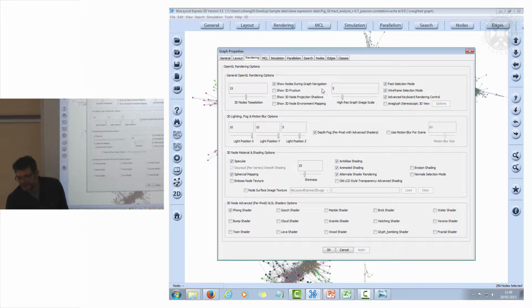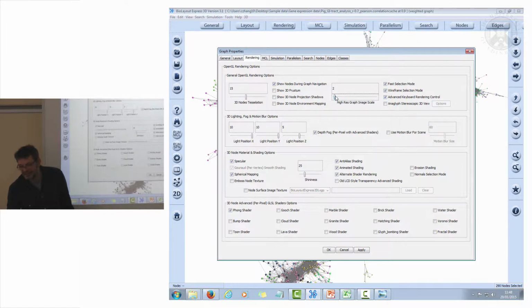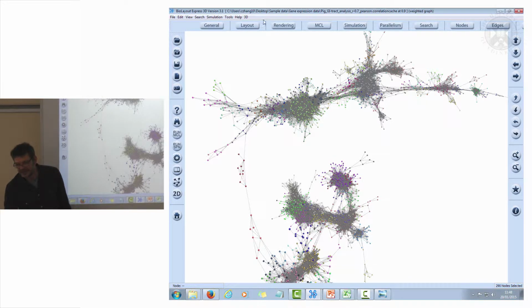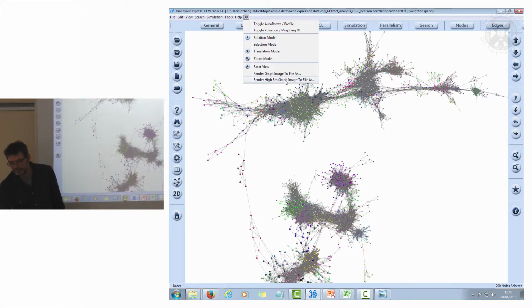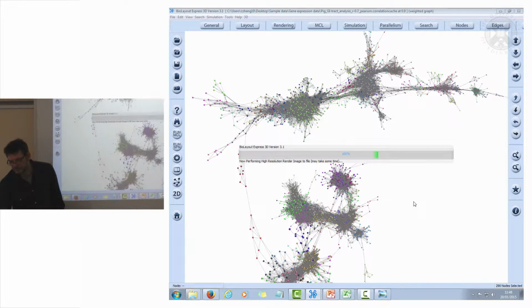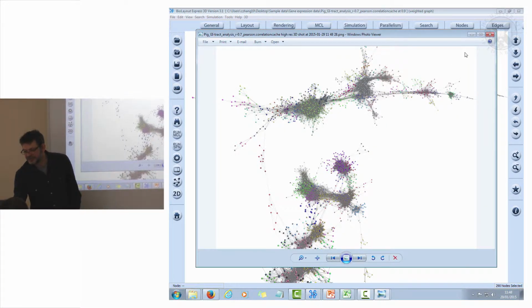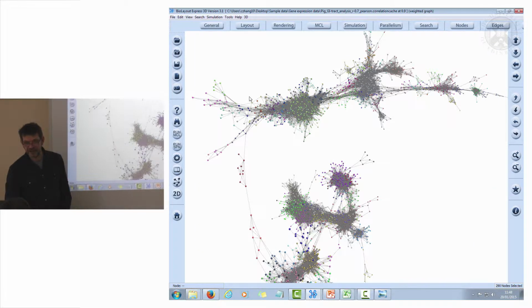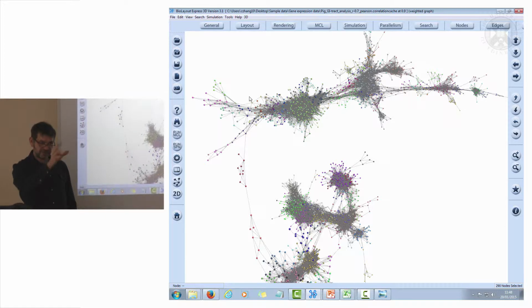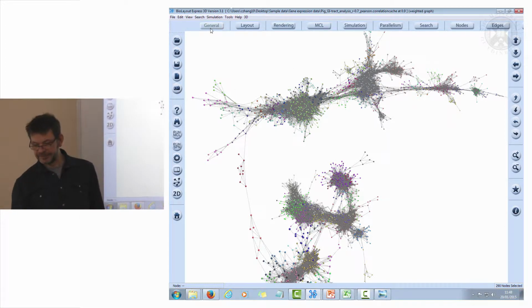And in rendering, this figure here will make it 5 times bigger. So I generally use 2, and that's big enough for all publication, and that will be a lot faster now. The file will be a lot smaller. Done. Okay. So the first thing out is a nice picture that you want to generate, and going over to 2D, sometimes you can make a nice picture, move things around, make it nice and pretty, and you'll go on and annotate that later.